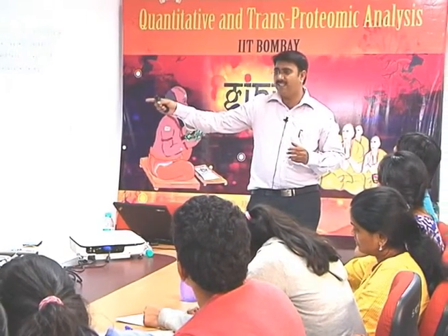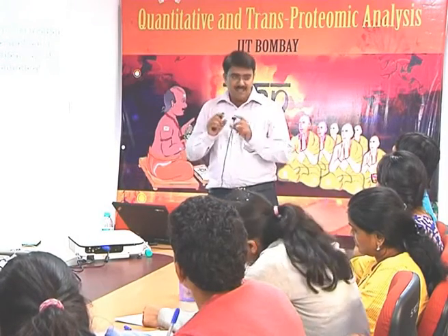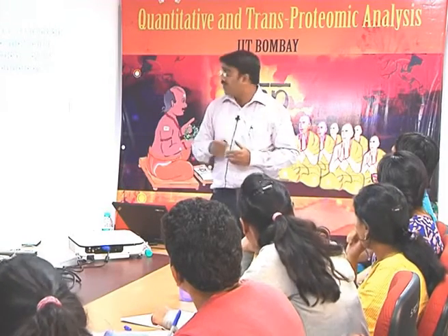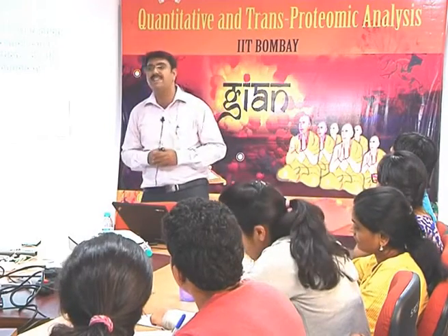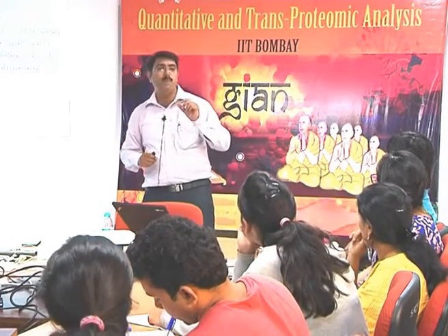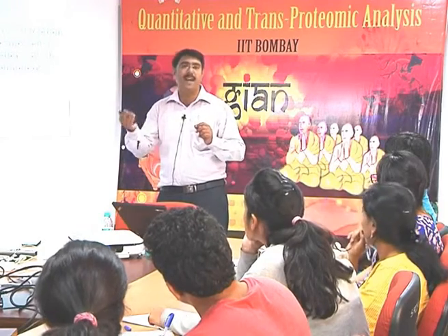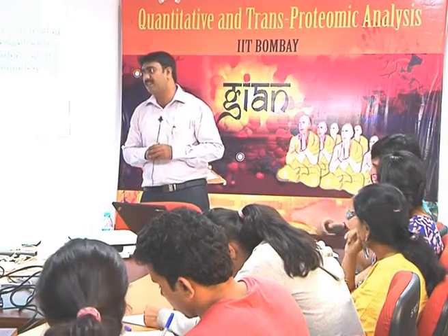I think in the last session there was one technology called NanoTemper. It is once again a solution-based, solution interface. Here I am going to discuss the solution-solid interface. What exactly is the solution-solid interface? Suppose two proteins are interacting together. One protein has to be put on a solid support and the other should be in solution form. That is what we call a solution-solid interface.